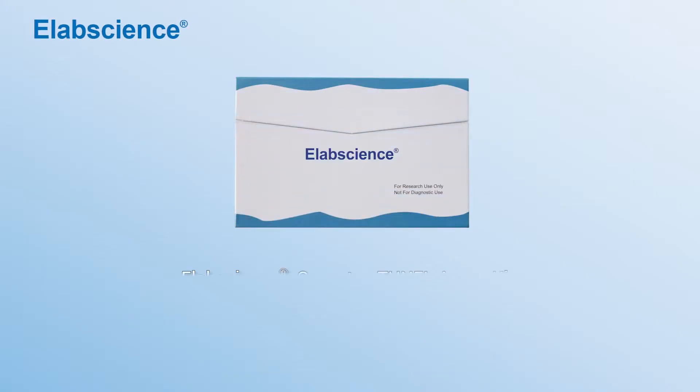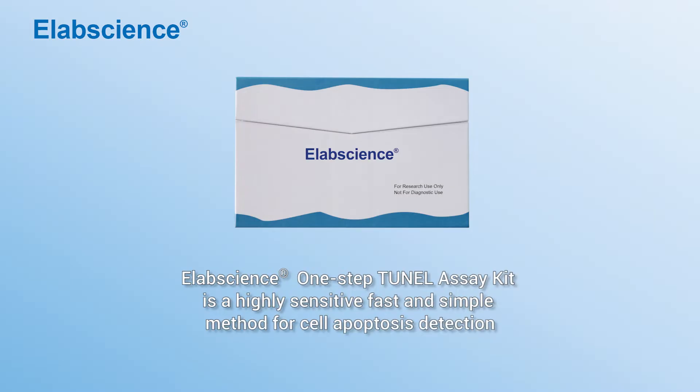Elabscience One-Step TUNEL Assay Kit is a highly sensitive, fast and simple method for cell apoptosis detection.